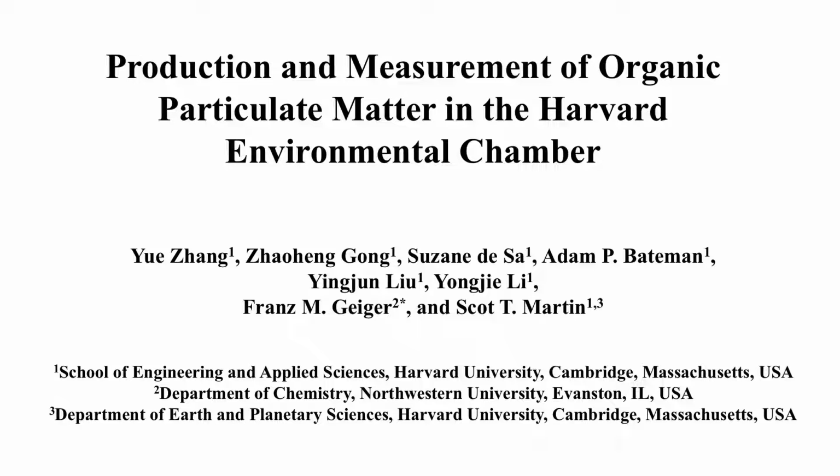The overall goal of this project is to produce organic particulate matter in the environmental chamber and characterize its chemical and physical properties. The Harvard Environmental Chamber was built to study the formation of organic particulate matter and the reaction of gas-phase components at close to ambient conditions. This is the 10th year anniversary of chamber operations.